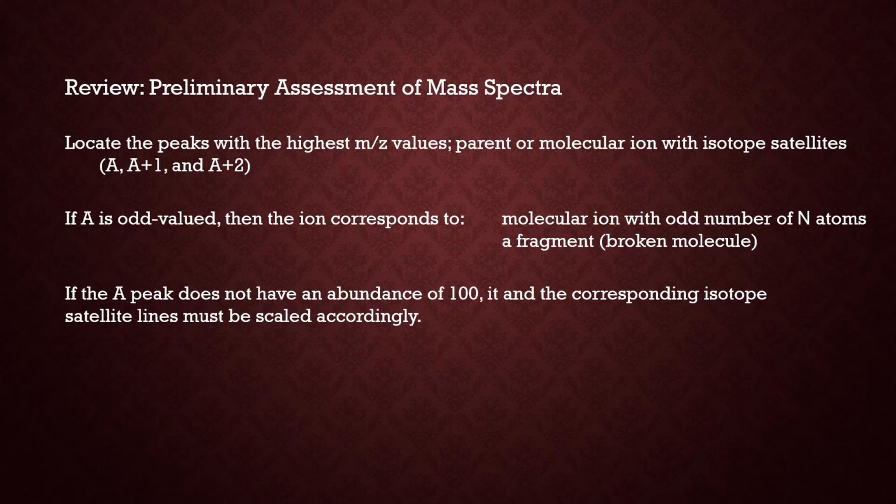If it's even, then it is an intact molecule, and if it has nitrogen, it must have an even number of nitrogens in that molecular skeleton. If it's odd, then it is a fragment, or it is a molecular ion with an odd number of nitrogens.